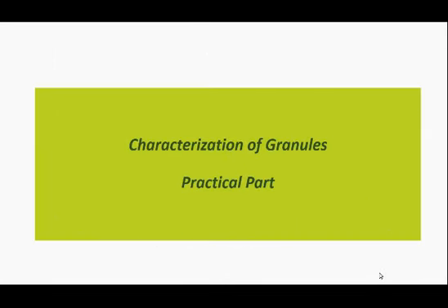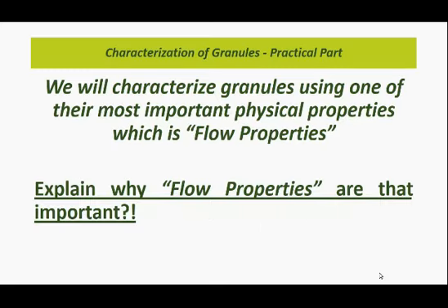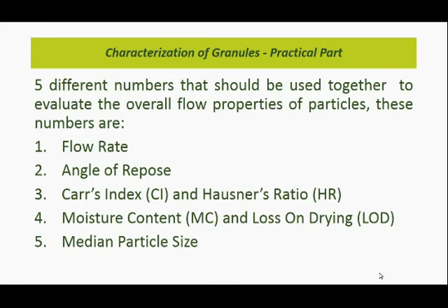Hi, and welcome to Characterization of a Granules Physical Properties Experiment, the practical session. We will characterize granules using one of their most important physical properties, which is flow properties. Again, explain why flow properties are that important.